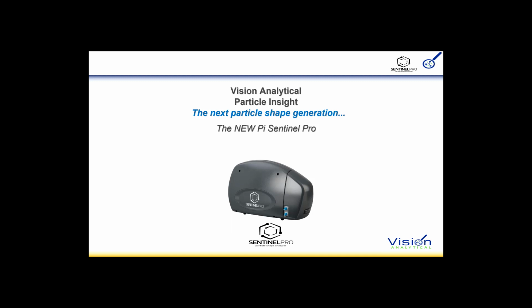Statistical process control capability is included, and the ability to track shape changes over user-defined time intervals. So for example, you could look at the dissolution of ingredients into, say, a solvent over time. You can do 1 minute intervals automatically and then overlay those results to show how well the particle has gone into solution.